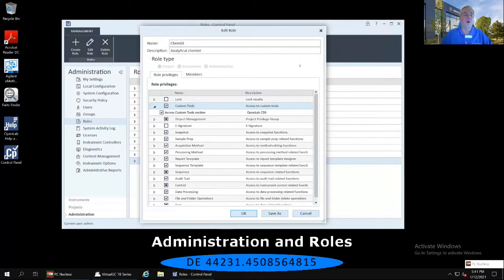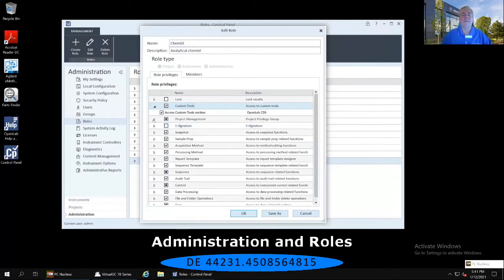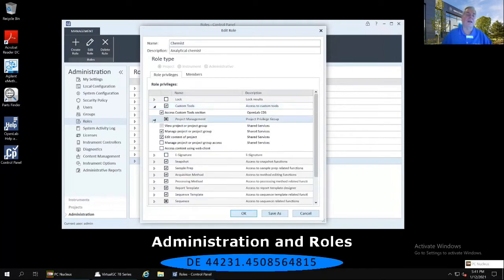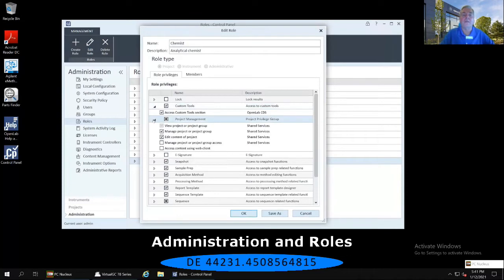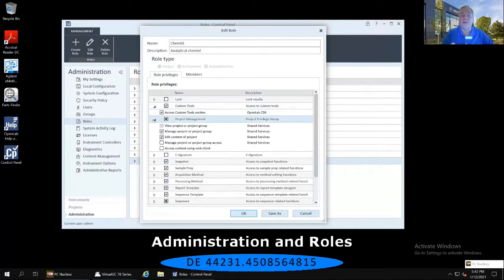Let's go to the Project Management, immediately below the custom tools. Select that right-facing arrow to the left of that Project Management, and notice that only two out of the five available, one is defaulted on, have been activated for this particular role.